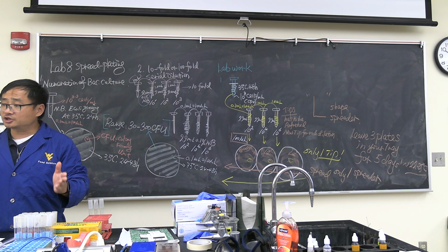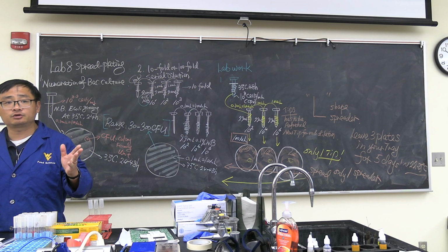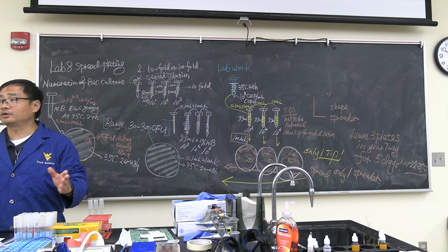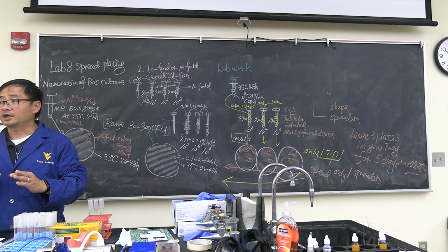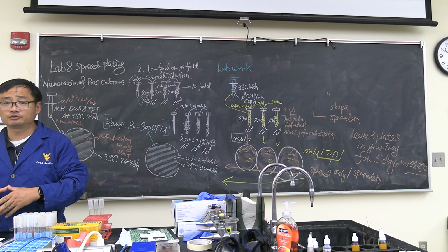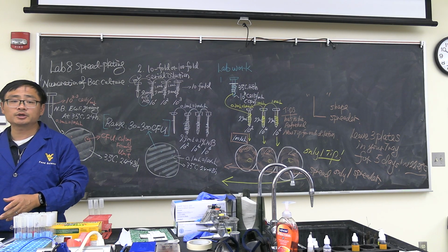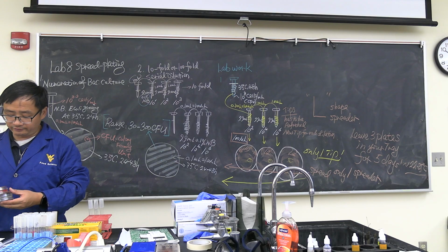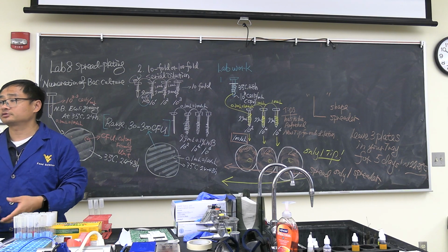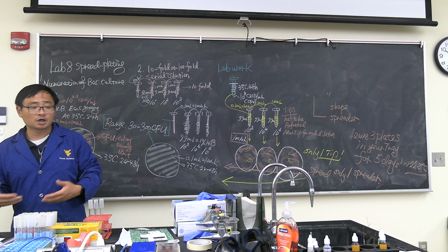Now, during the exam 1 review, which means the midterm exam lab review, I'll tell you the scenario, what it looks like. I'll give you an example of Staphylococcus aureus and E. coli, then you go ahead to fill the table. And during the review, we're going to re-emphasize it. Is that okay? Today, you can take the picture, just to record whatever you got in your notebook. If you want to do the bonus points, like I said. Because this is a little bit older and it's hard to see.